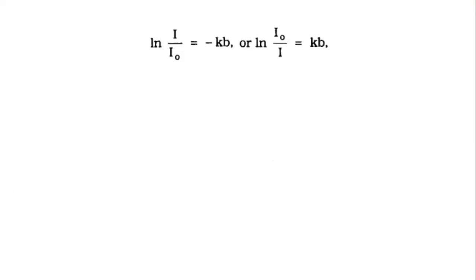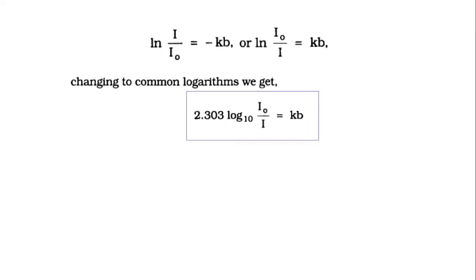And then we tried to simplify the relation and arrived at a relation which tells you that the amount of light absorbed is directly proportional to the thickness of the absorbing material. In the similar manner, when we talk about increase in absorption in relation with the thickness, what is absorbing inside the absorbing material are molecules or atoms. When we increase the thickness, we are increasing the number of molecules in the path of light. Hence the thickness is also very routinely referred to as path length.